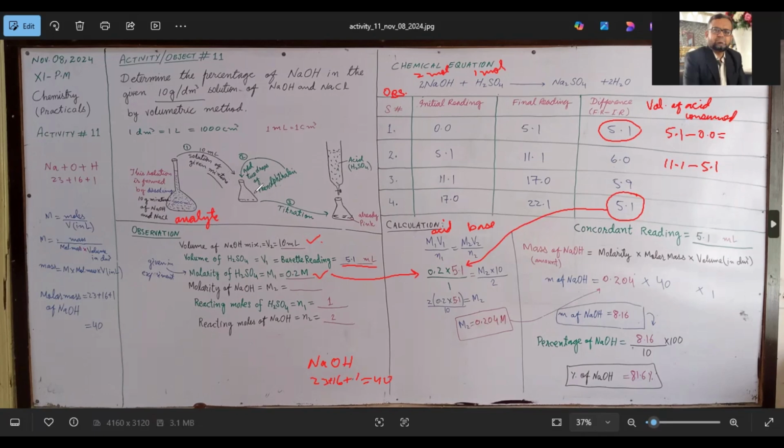8 point, not this 10 ml. This flask has 8.16 gram of the sample. Okay. But remember that it was in this flask. And why we have divided it by 10? Because the 10 gram sample was there. So out of 10, it was 8.16.